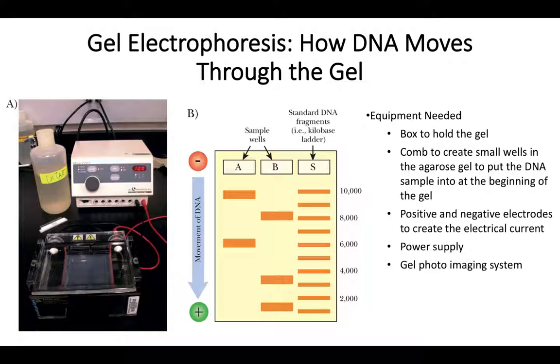So as it's negatively charged in B in our diagram here, DNA would move from a more negative to a more positive side based on the electrodes that are connected as we create voltage or electricity, an electric current through our gel. So DNA would move from a more negative to a more positive side. So the more negative side is where we would load our samples.